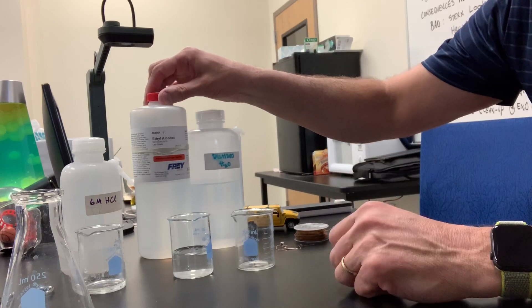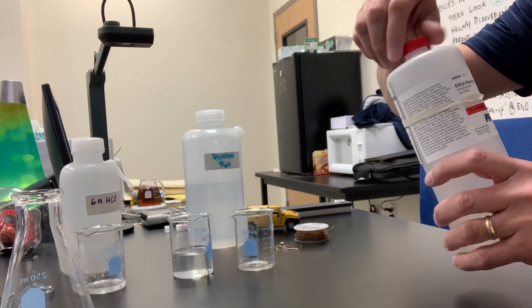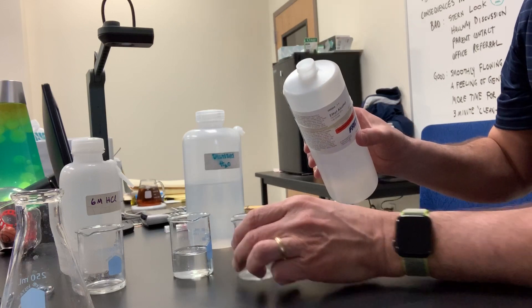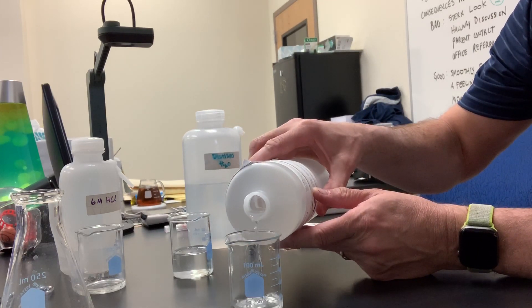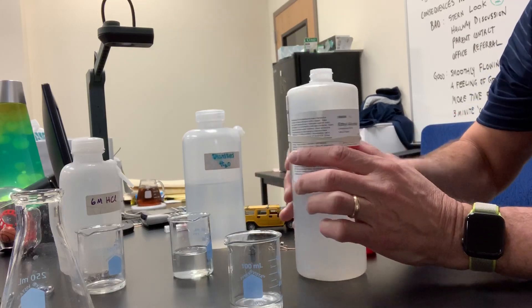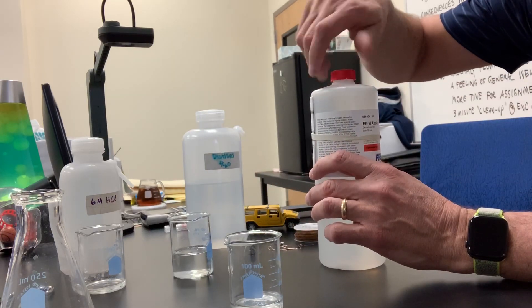So here's a bottle of ethyl alcohol, also known as ethanol. Let me open it up in this beaker here, and you'll notice it's a liquid at room temperature. Look at that, it's a liquid at room temperature, and its color.